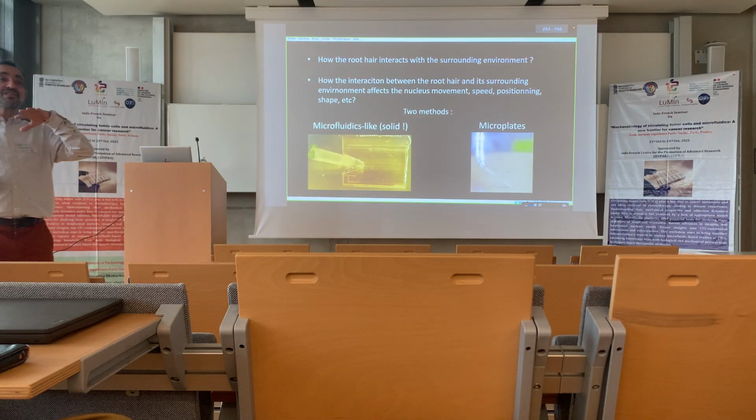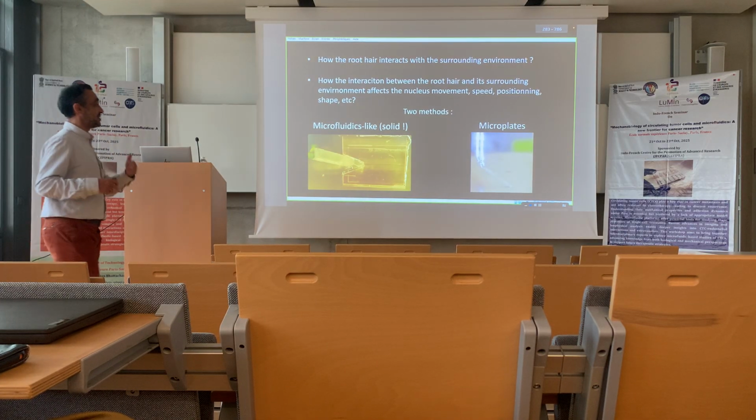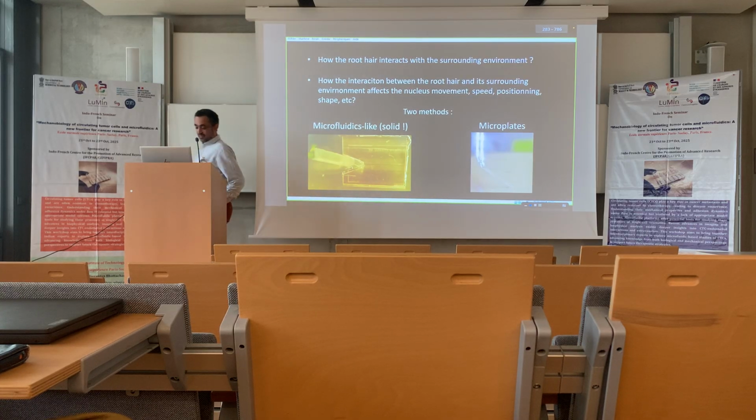Inside we put agar, which is first warm and fluid, then solidifies, and you can change its stiffness. The other technique, and we can combine both, uses microplates or micro cantilevers to measure or apply forces and test everything.